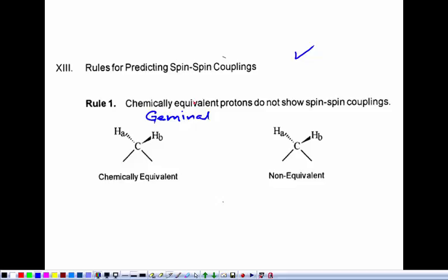But ultimately we want to get to the point of being given a spectrum and trying to figure out what the compound is. So far we've done matching, which is the best way to start. But the only way to do the other is to really get more information. So we're going to go back and quickly review what we've done over the last couple weeks, and then talk about more information that will be helpful.